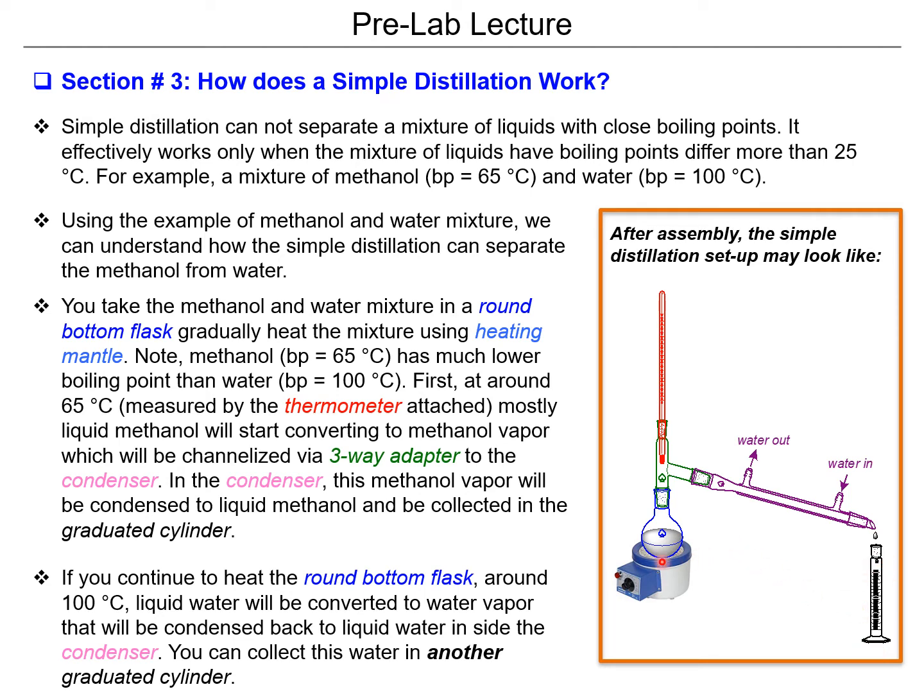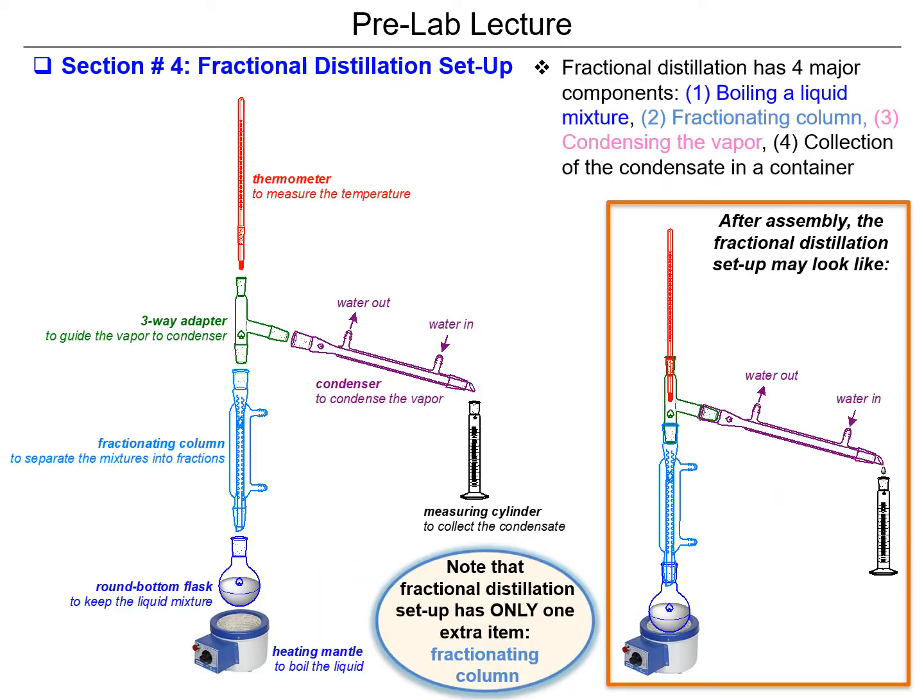One important thing to note is you never want to boil this flask until it's completely dry, because, well, in this case we have water, so it's not that dangerous, but other solvents, if you do that, they could explode. So that's a safety issue to be aware of.